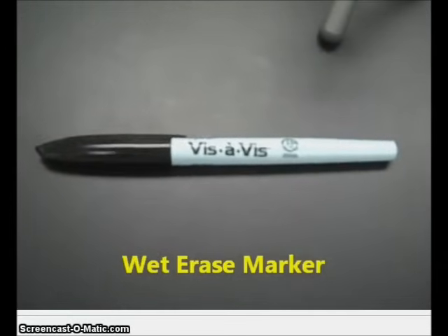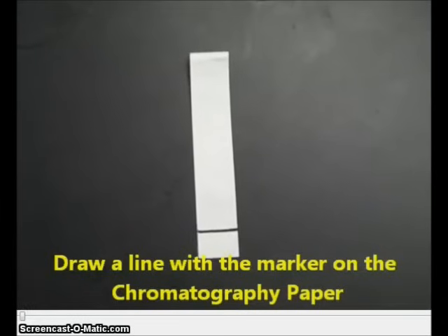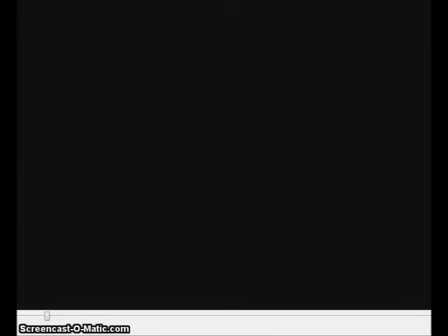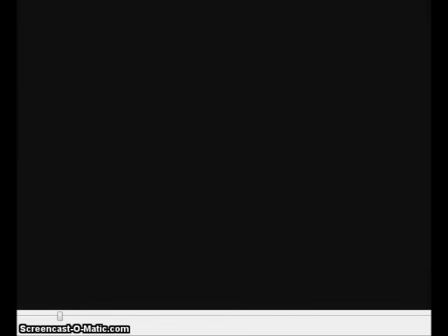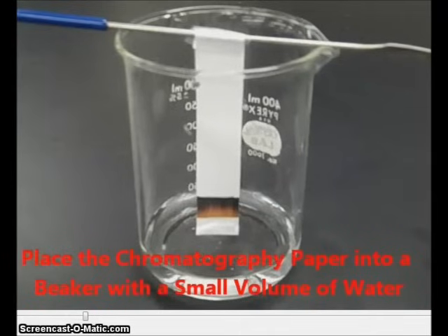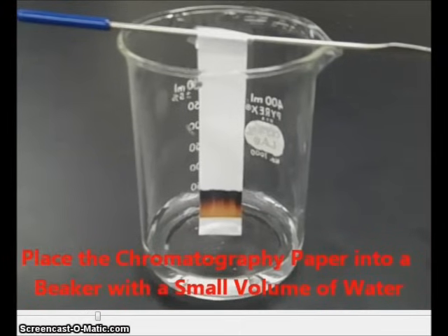So a vis-a-vis marker is wet erase, which means that the pigments are water soluble. We'll start our experiment by drawing a line with the marker on the chromatography paper. Then what we want to do is insert that chromatography paper into a beaker with a small volume of water in it.